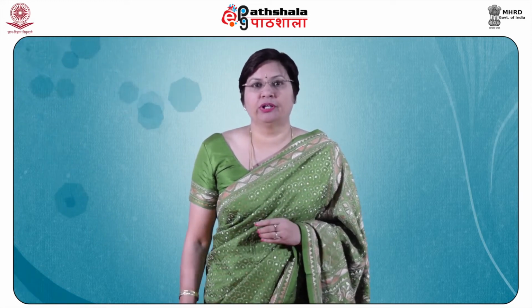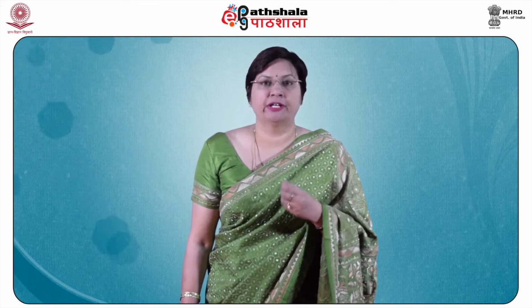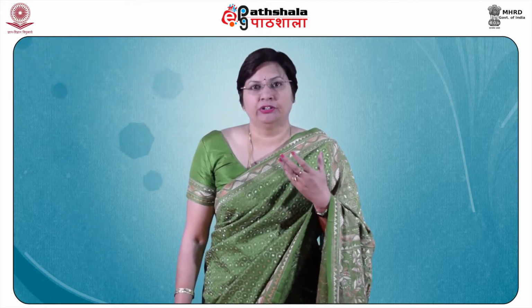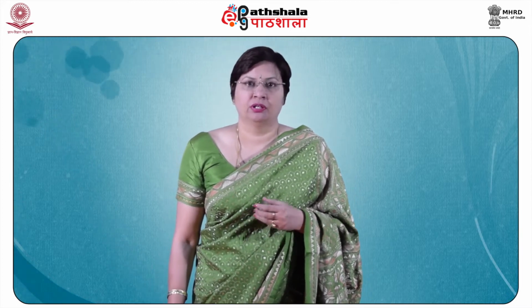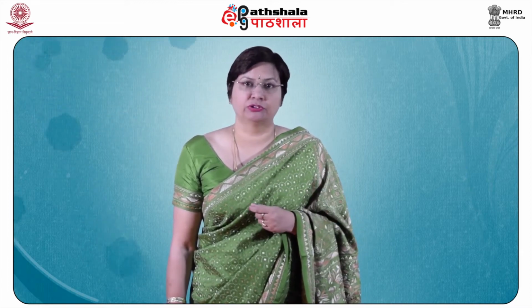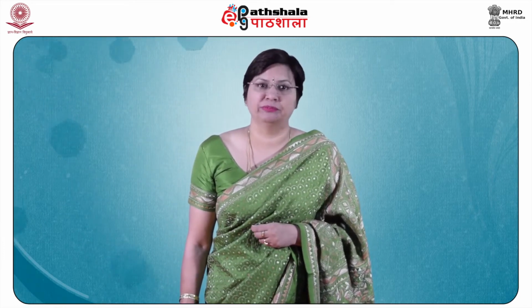You should be able to correlate the given spectra with some outcomes, and then come to the conclusion about what the structure of the given compound is. And you shall be able to interpret the spectroscopic data given to you. Before moving to the problems, we have studied some problems in the previous modules also, but we shall continue this in this module, because after going through these problems, you shall be more confident in solving similar problems.